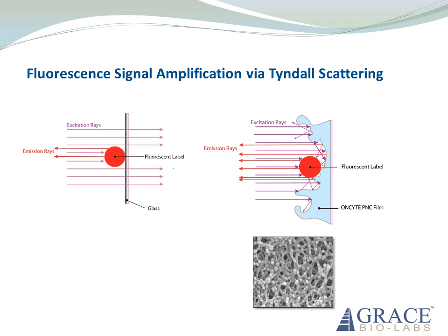Of all the light that is focused on the surface, only a tiny amount excites fluorescence, and of the emitted light, only a tiny amount is captured by the detector. This means that the digitizing scanner has to have extremely sensitive electronics to detect the signal.